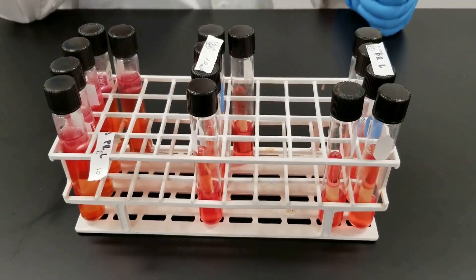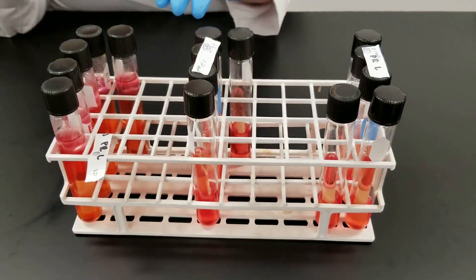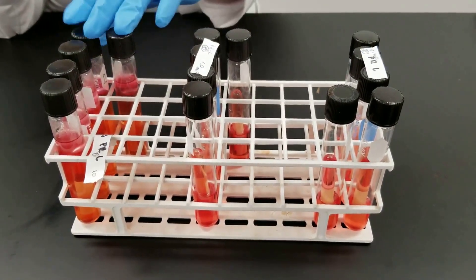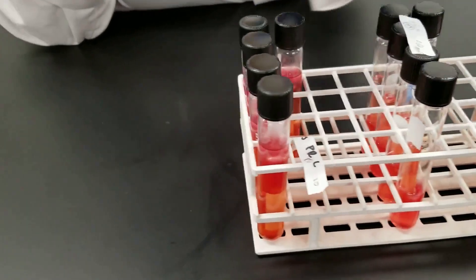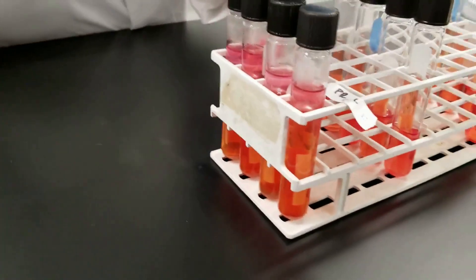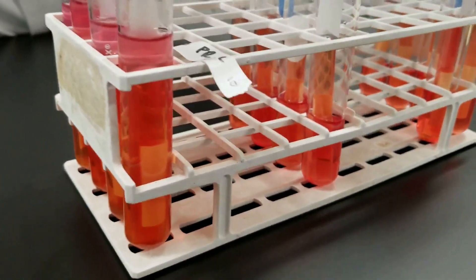In this process, we had five tubes at different concentrations that we added our water sample to. This was a double strength phenol red lactose. All these are lactose. In this first one, we added 10 mils of the sample, then 1 mil, and then 0.1 mil.